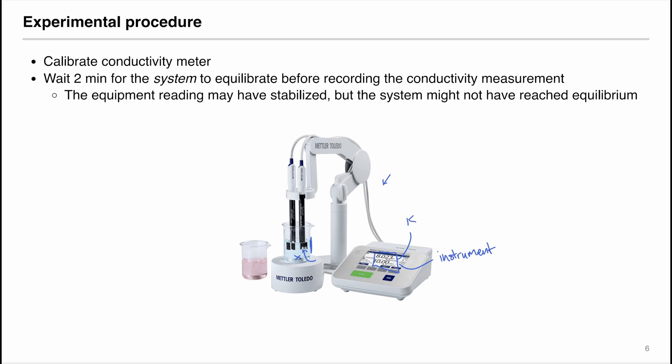We don't wait for the instrument to equilibrate because the instrument equilibrates quite fast, because the measurement is quite accurate. However, we want to wait for the system to equilibrate because the micelle formation might take longer time depending on the surfactant. So you could possibly see that the instrument has values that are increasing or decreasing over time. That is because the system has not equilibrated.